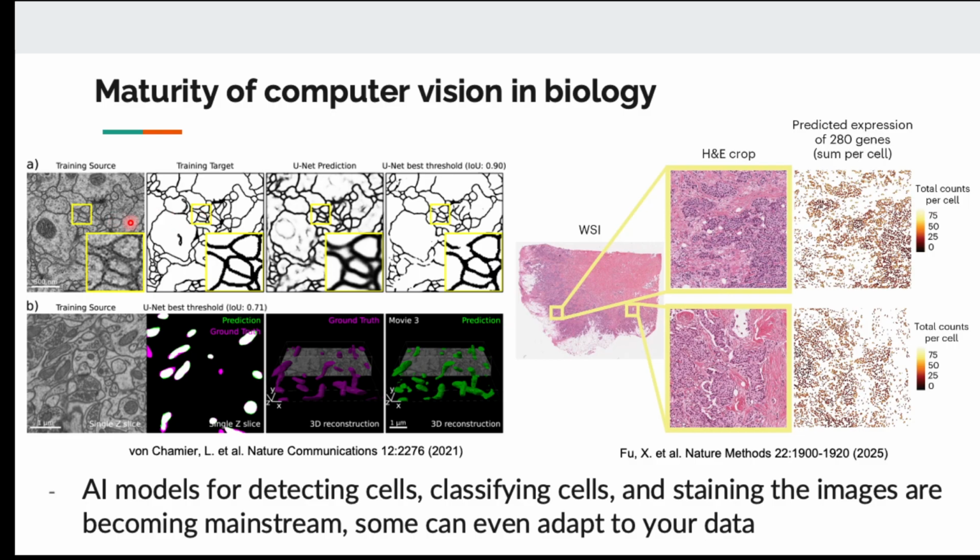The first step, they're going to apply a threshold to identify dark areas as potential fiber structure. And it automatically removes the circular objects as nuclei. Because the fiber, we imagine that it's elongated, like branching. It shouldn't be oval, it shouldn't be circular. So we can use the circularity of the object to remove the nuclei as well. And we are left with just the fiber part of the protein.